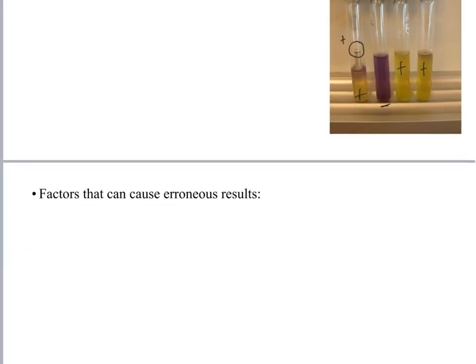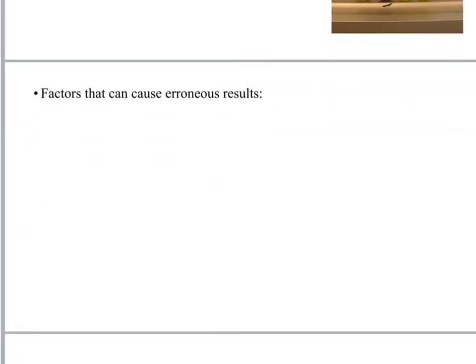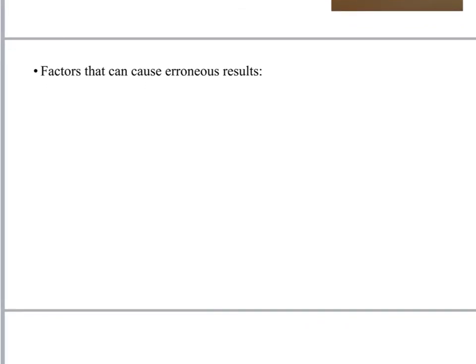Okay, one other thing that I want to bring up in terms of reading these fermentation tubes that we have to be aware of. What can give us erroneous results? Well, one big thing we have to pay attention to here is incubation time. If we incubate these tubes for too long, say we forget about them and leave them in the incubator 3 days or 4 days, or say we inoculate the tubes too much.